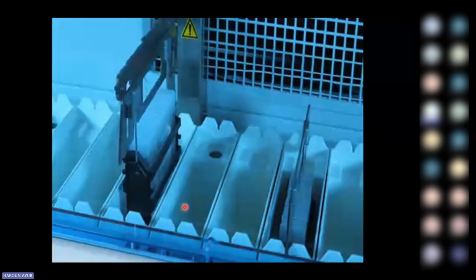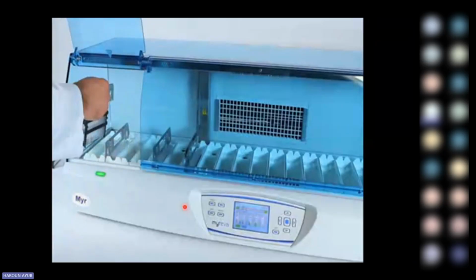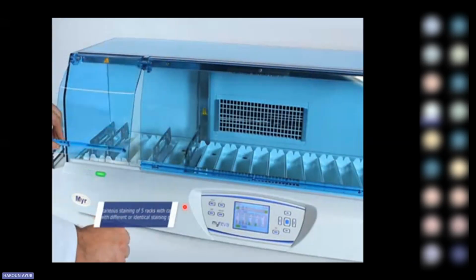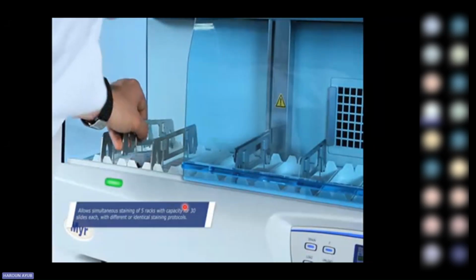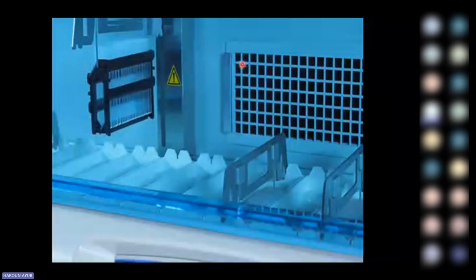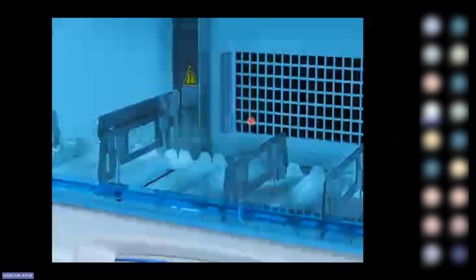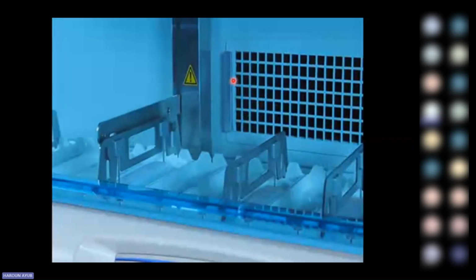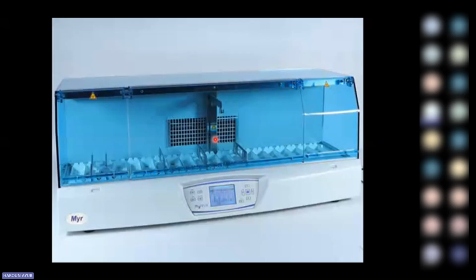So as this process is being done, you can still be at your grossing stage, and you do your grossing, take it to the STP as these other processes are going on. So it reduces a lot of work process. So this is the carbon block filter that we said. So there are 2 blocks and can be replaced by the user at any point. It is just to unlock the magnet. This is just held by magnet, and then you pick it up and so on.